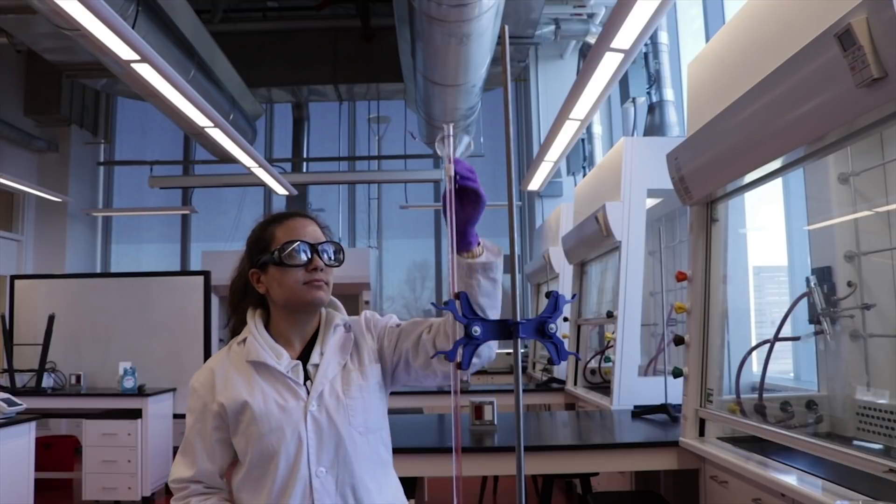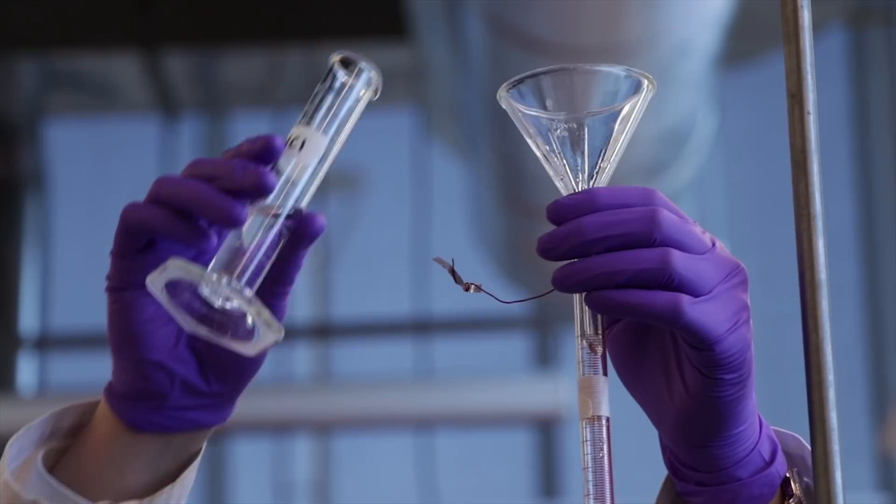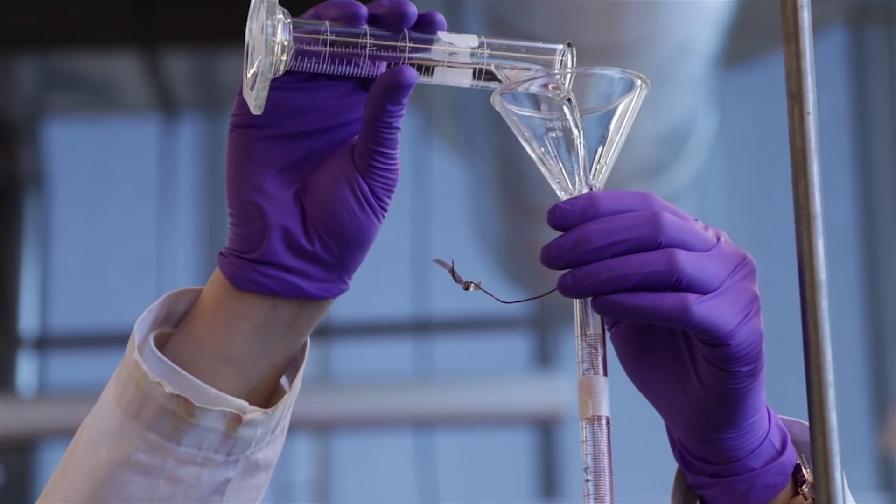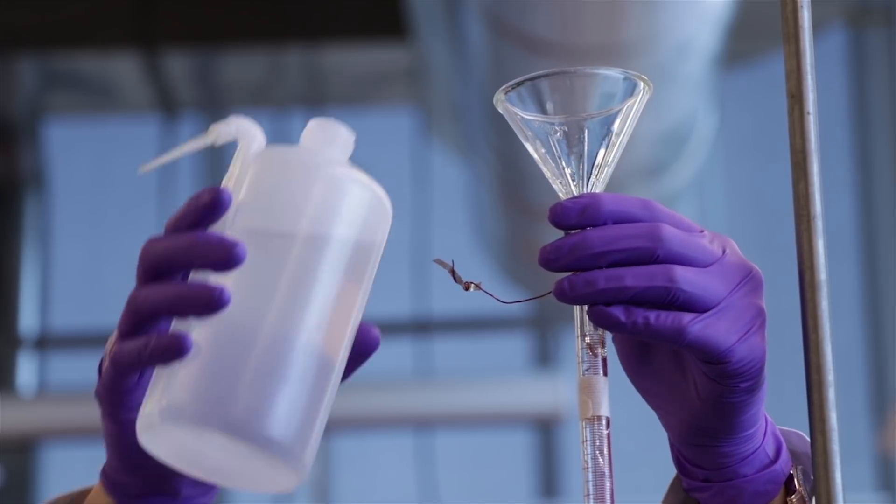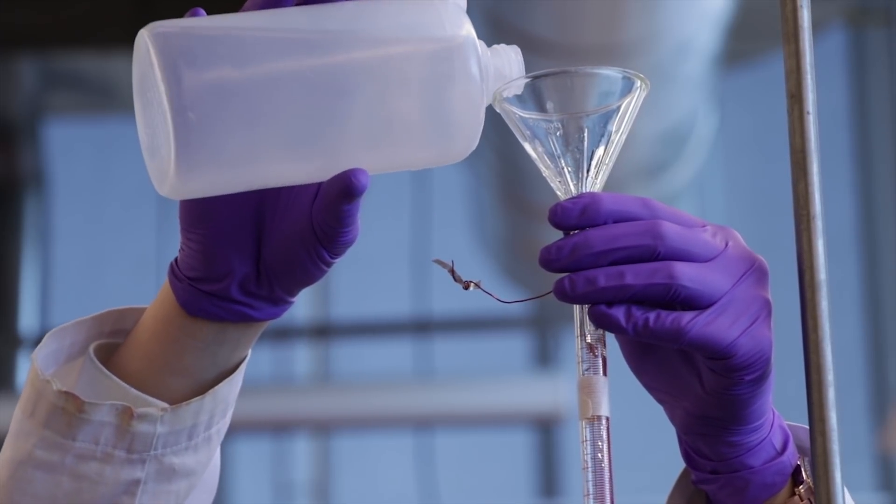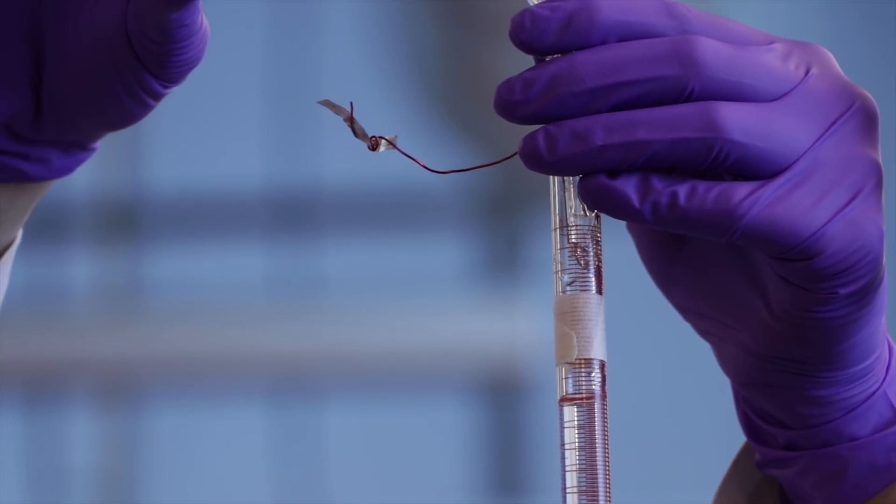Next, pour 12 mils of 3 molar HCl into the burette. Remember to wear gloves when working with HCl. Wash down the acid from the walls of the burette with distilled water and fill the remaining burette with water up to the level previously marked with tape.